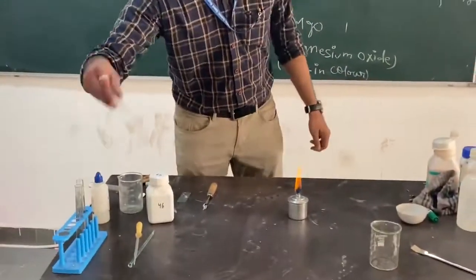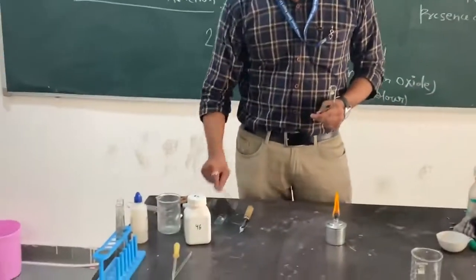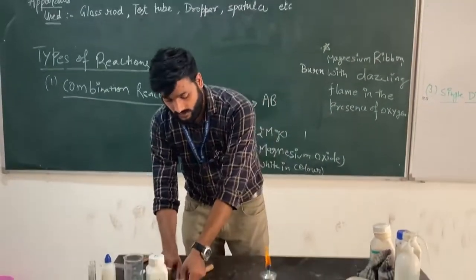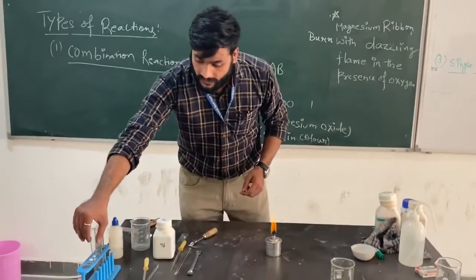So here you can see this is a test tube, spatula, glass rod, and the dropper. We will use this apparatus in this experiment. Now let's start with the experiment.